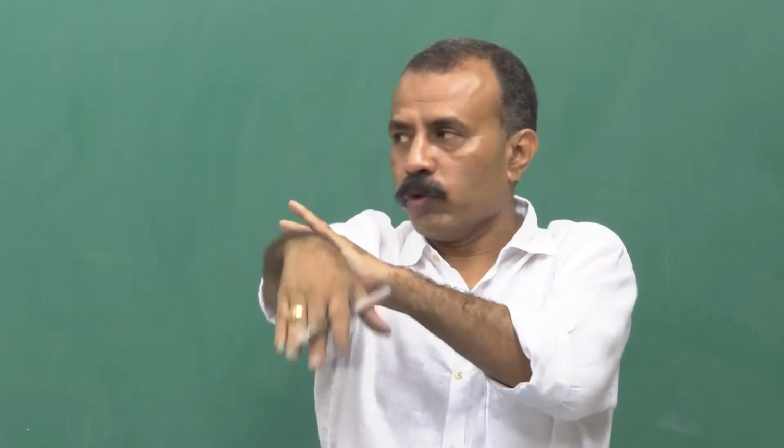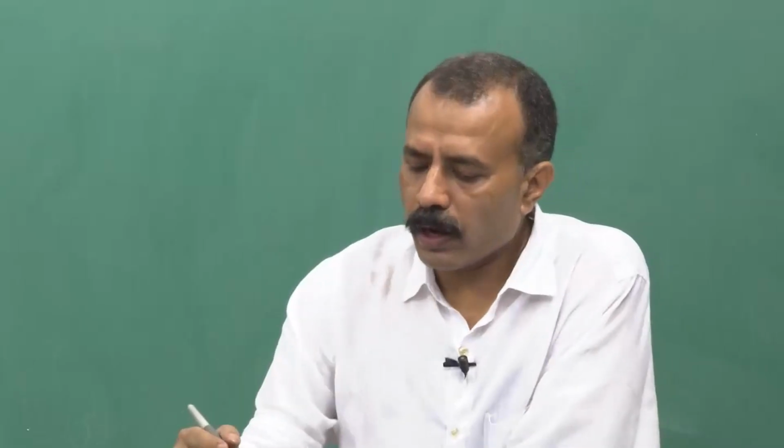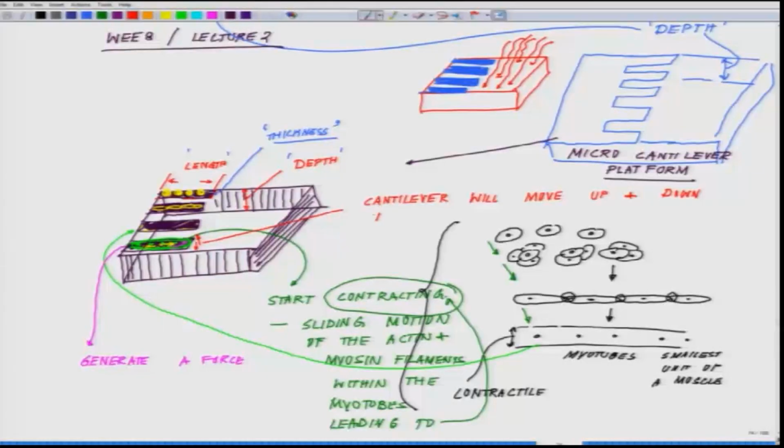So, it will only move up and down, thus oscillating proportionally to the force generated by the myotubes.